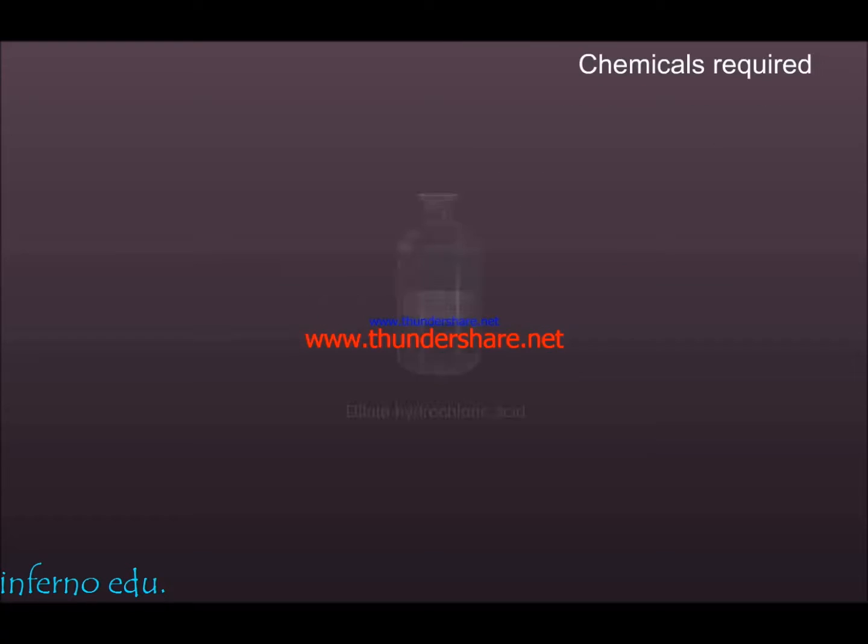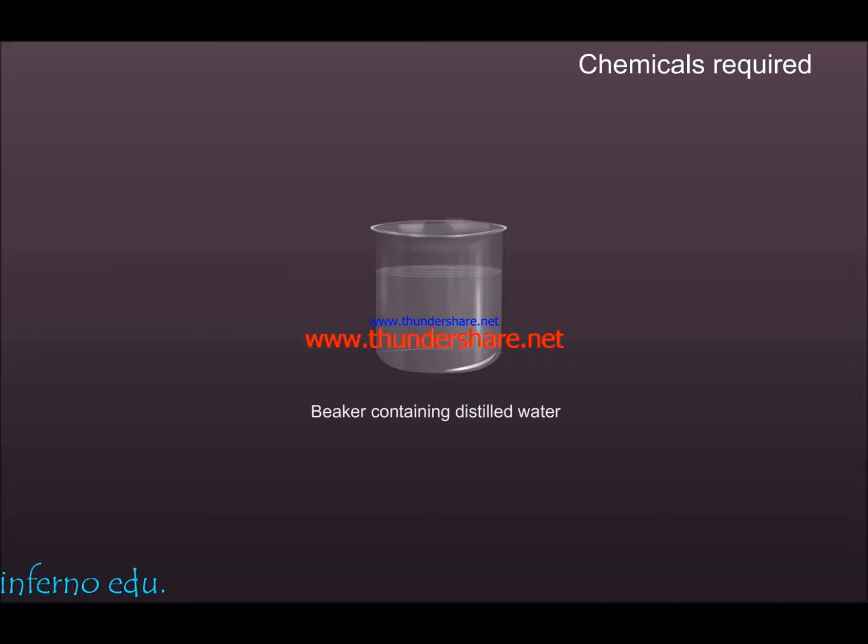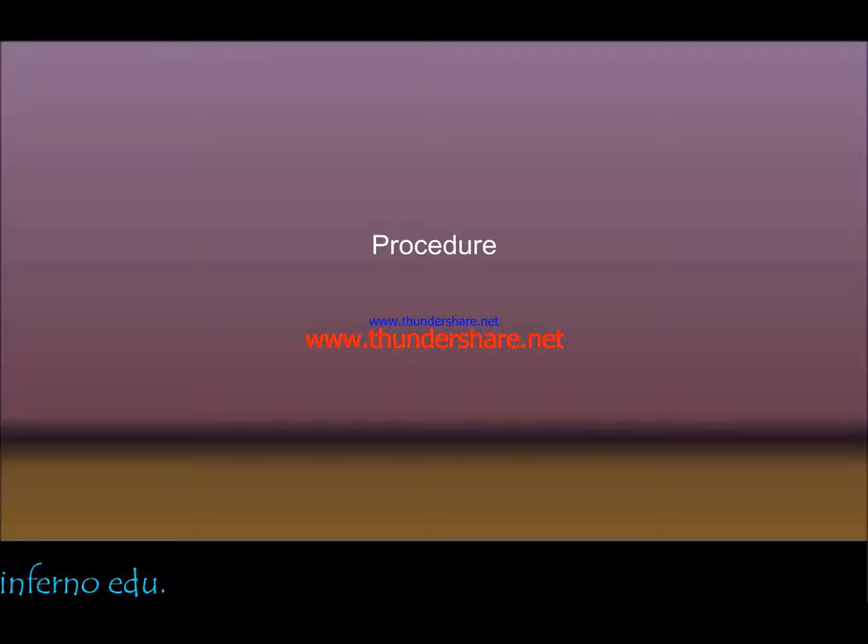Chemicals required. Dilute hydrochloric acid. Sodium hydroxide solution. Dilute ethanoic acid. Lemon juice. Sodium bicarbonate solution. Beaker containing distilled water.